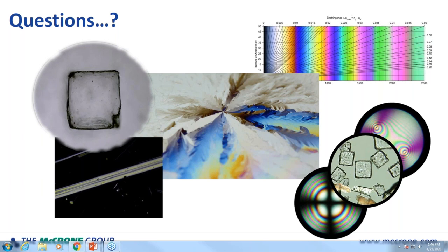You just have to get a polarizer in line before the reflected light strikes your specimen. You can set that up. We have Nikon microscopes. We set that up all the time. In fact, I suggest for most of my clients and the people I work with, if you're buying a new microscope, make sure you have the ability to do both so you can use this in a multitude of different ways.